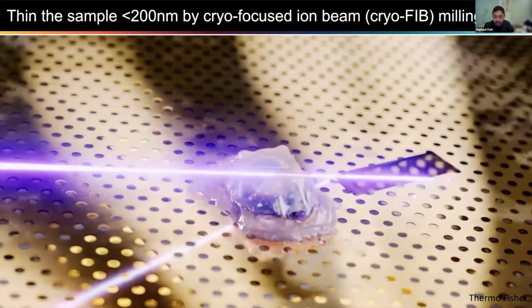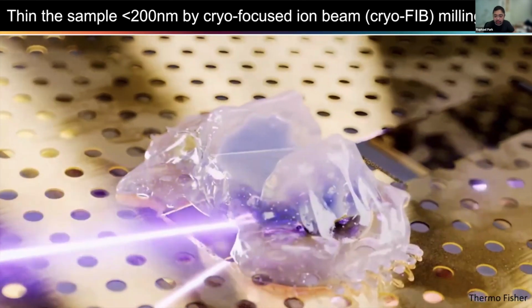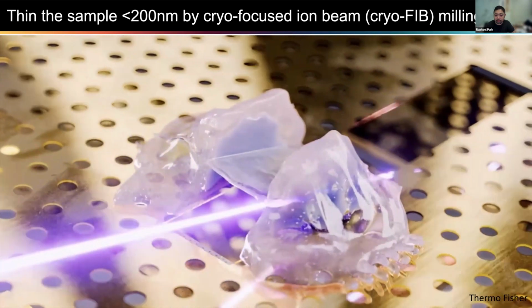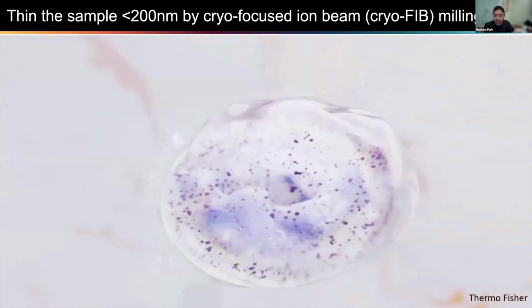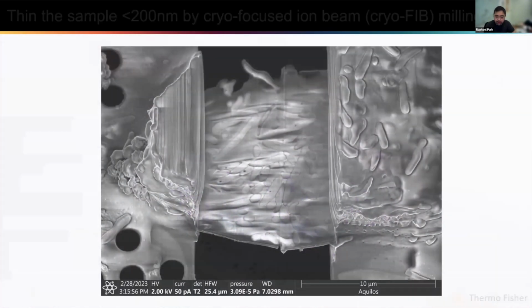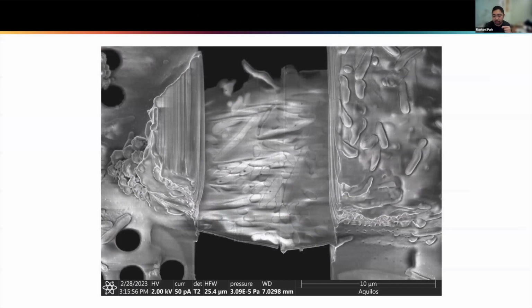So we're using ion beam to cut top and bottom of the specimen, in this case, a mammalian cell, leaving a small section where you can do cryo-ET imaging on it. And this is just one example of such specimen that I generated here at Scripps. This is just a biofilm of a bacteria.